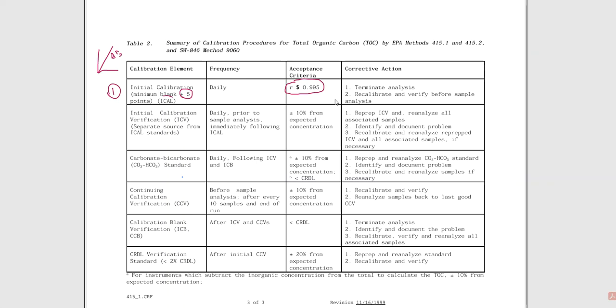So this means as a lab worker, if I go into an environment and I am manually doing this, and I don't know what I'm doing, and I'm not being really careful with the pipetting, with the lines on the volumetric flask, with the way that I mix and process these standards, folks, everything else cannot be done. I'm wasting my time. I'm wasting the company's time. Samples cannot get processed. We cannot report the data. It's just the way that it is.